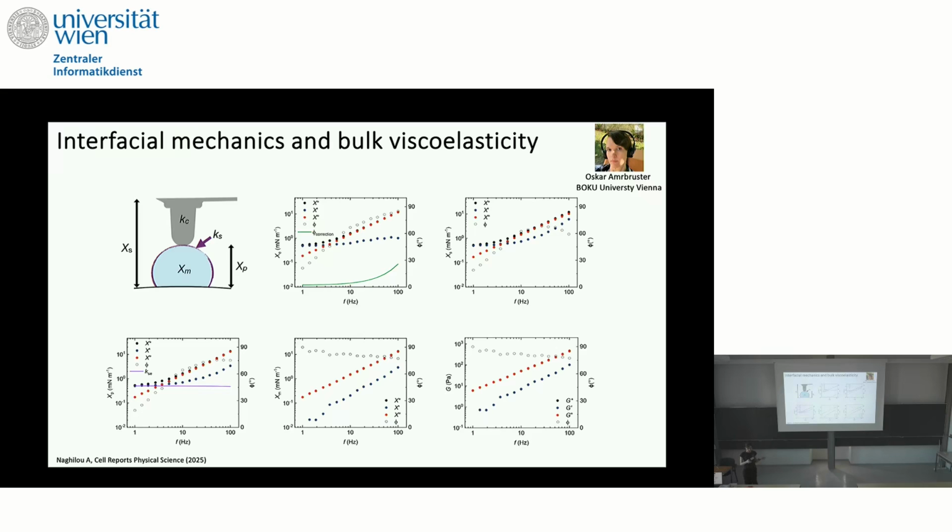And that was the easy part, because actually Luis Chavez showed that at lower frequencies, ideally the frequency being 0, but we don't have that, so we take the lowest frequency, and at the lowest frequency, the contribution of the bulk material is negligible. So it means the spring constant you have is actually only the spring constant of the surface energy.